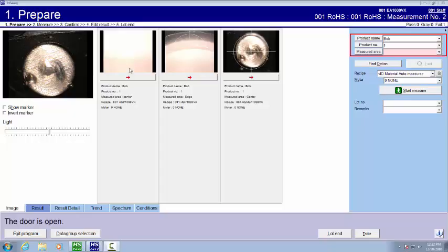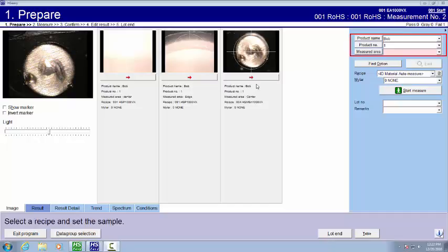Now to the right you'll see these three columns. Notice that the third column matches my sample type, so that would be the right one to use to measure this sample.